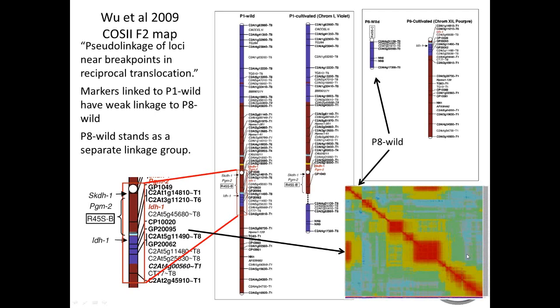And we saw this really nicely in CheckMatrix. Basically what CheckMatrix is saying is that the markers in this area have pseudo-linkage with the markers in this area. That's why you see these dark red dashes over here. This is not what we want to see in our genetic maps. And there's a very nice breakpoint here which basically says this is a big gap, there's a lot of recombination. Here's a probable area where the pseudo-linkage exists. So this is basically a mistake.